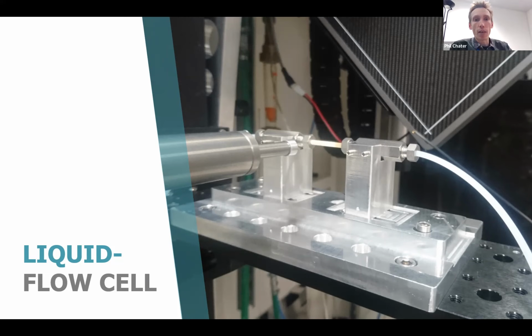And the thing that all of these have in common is that they have very low and reproducible backgrounds for our experiments. So that's the kind of thing that we can do with the beamline. I'll go into some more details later on. But now I want to talk about what we do with the data when we have it.